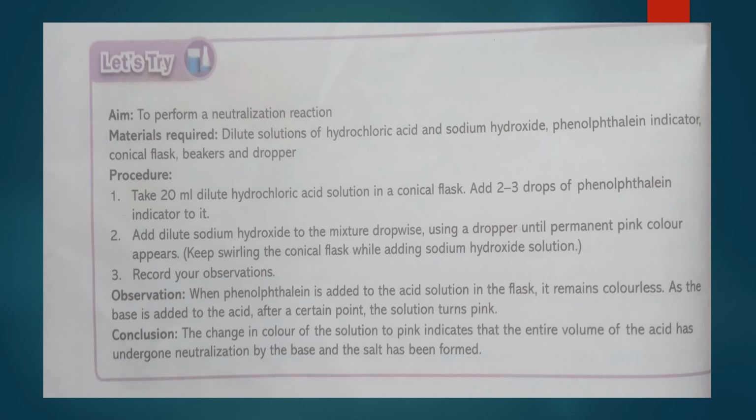Step number 2: add dilute sodium hydroxide to the mixture dropwise using a dropper until a permanent pink color appears. Keep swirling the conical flask while adding sodium hydroxide solution. Now record your observation.